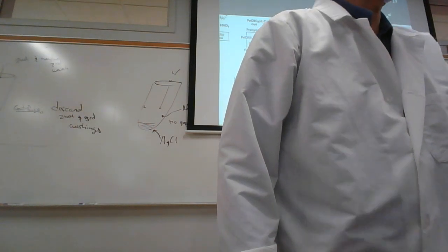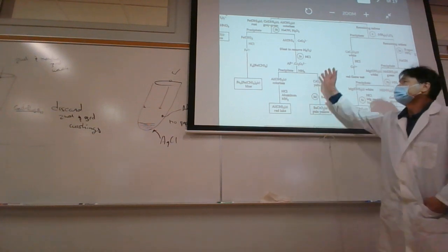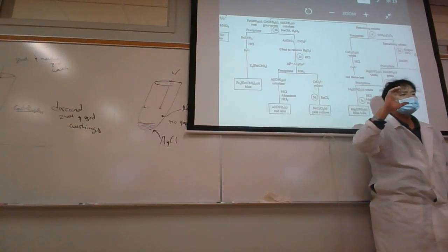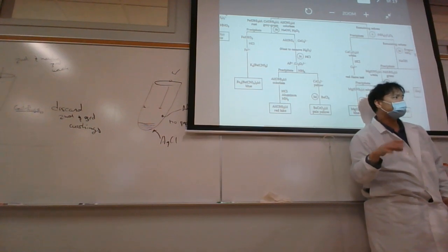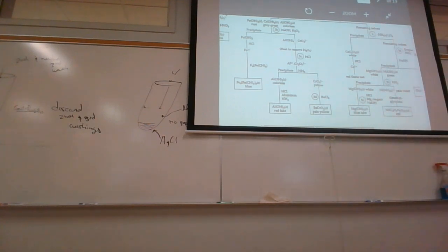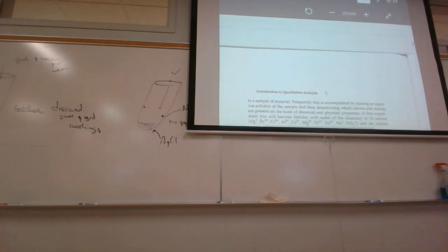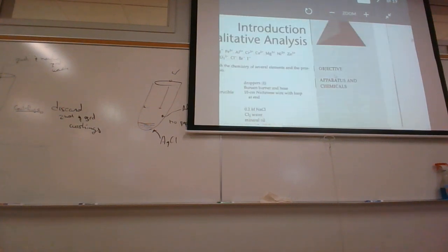It's separate? It's separate. So we would theoretically do this whole thing twice? No. For the known, you're going to go through all the cations here, and then you're going to take a second sample, which is actually a totally different sample. It's the anion known. Because of incompatibilities, we can't have them both the same, so you'll have a separate sample.